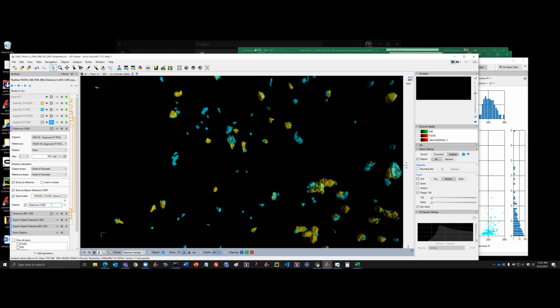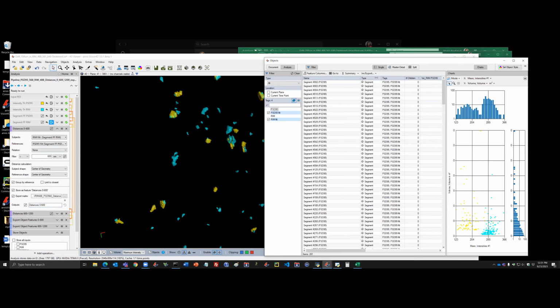And here is the name of the output, which I did not introduce today yet: we'll give a tag name in the objects table. So here are the tags for all the objects we have so far, that we can later access separately and distinguish this group of particles from other steps of the analysis that we are doing.